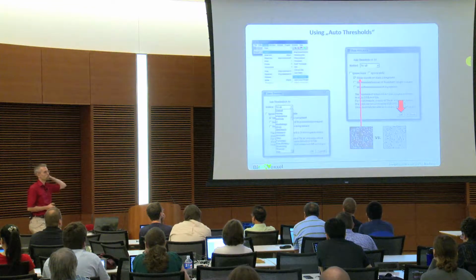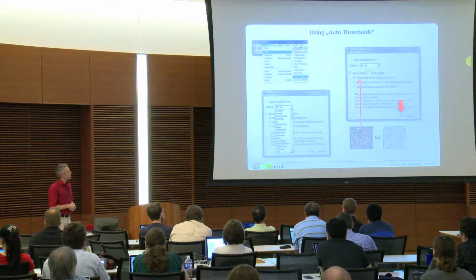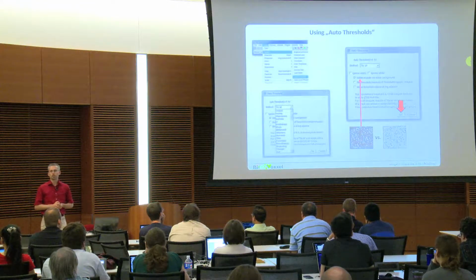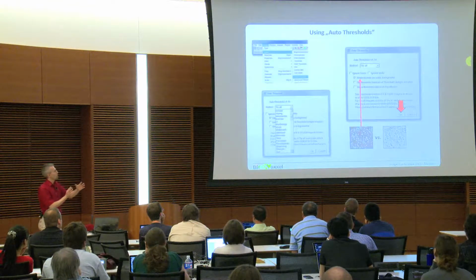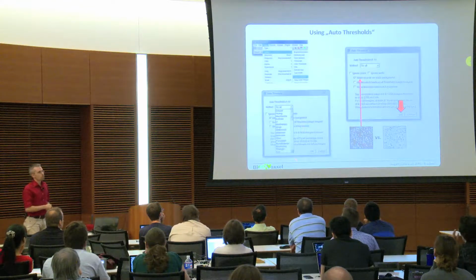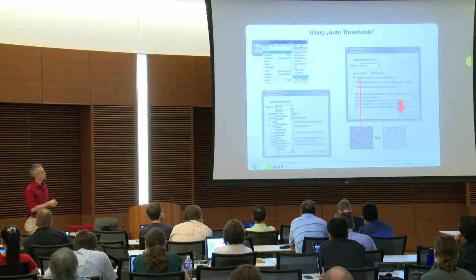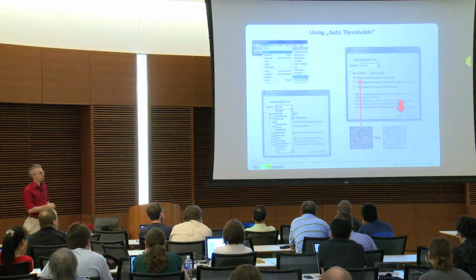Some of them are coming from the 1980s, so it's old stuff, but it's very good. 16 is still a bunch of things, but it has a lower bias because we go down from 256 possibilities to 16. So what can we do? In the beginning, we have no idea which one of the 16 is good. So we can test all by choosing Try all, which is also a nice option. We still need to tell the program whether we have bright objects on a dark background or the other way around.